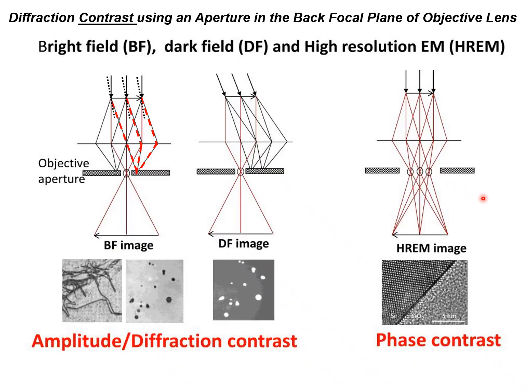The essence there is that you collect all the information, with a nice large aperture. So we're seeing interference effects in this particular case. And the larger the aperture, the smaller the theoretical limit of the resolution.